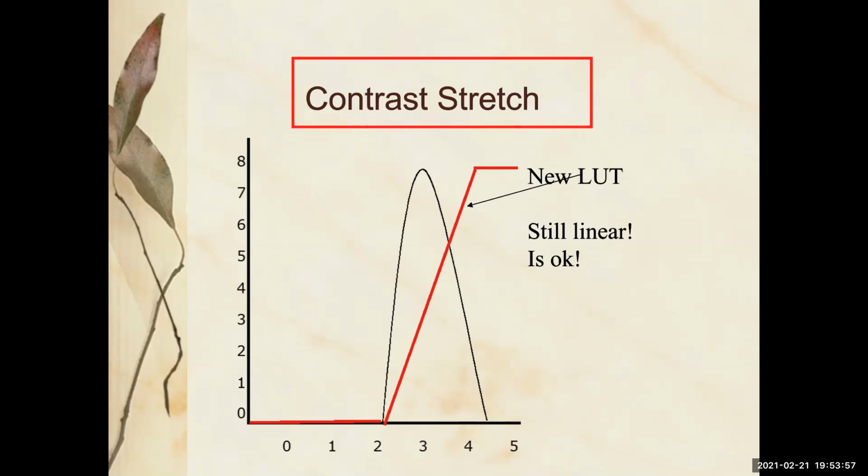If it's 2, let's call 2 0. After 2, we'll start acknowledging that these are different gray levels, but anything 2 and below is 0. That's also known as the offset value. And it's a legit thing, especially because when you get to the fancier scopes, you're going to learn there's all kinds of noise that comes in.